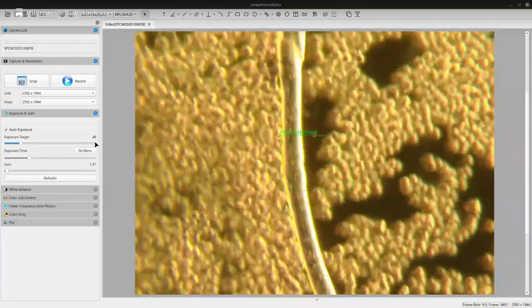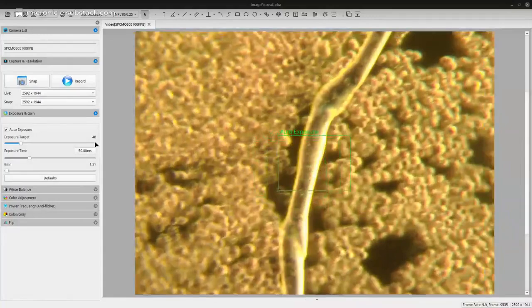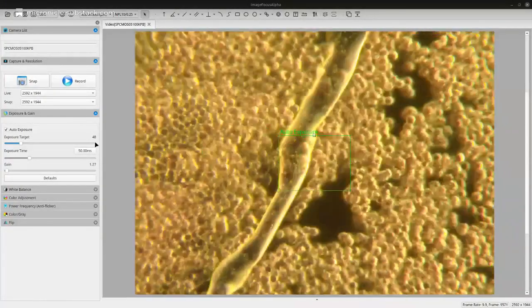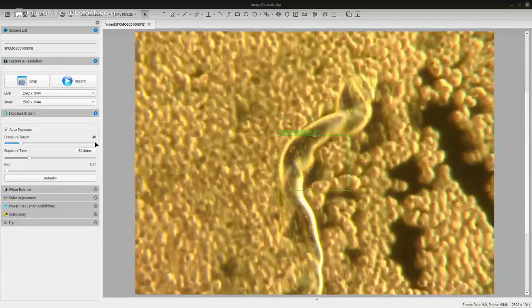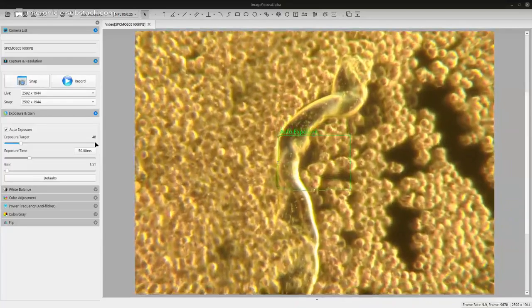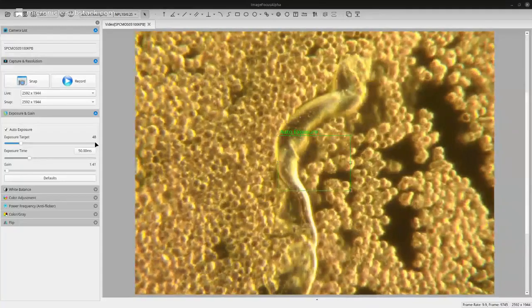I'm probably going a bit fast for the video. I'm looking at it through the lenses. It doesn't jerk around like on the video. So here's the top piece. I'm fairly convinced that's probably fungal.